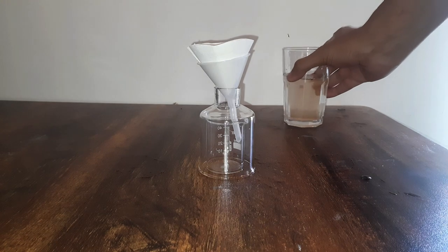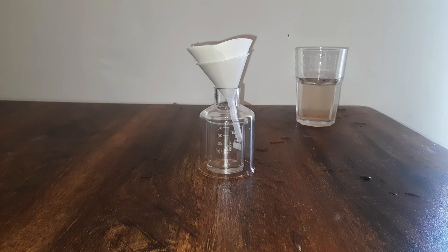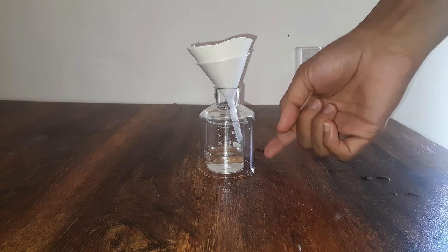I want you to observe what happens. This process took around 5 to 7 minutes — I have sped up the video, so you are watching it go by really fast, but it took around 7 minutes. Okay, we have enough collection in the beaker.